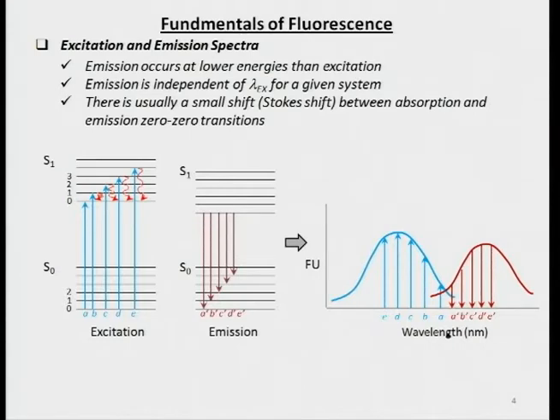Okay, so here's some background on where you should look for fluorescence. In essence, the excitation of the system gives us certain information. Most of the time the excitation is similar to the absorption spectra that we typically detect in a spectrophotometer, and it arises from the ground state to various vibrational levels of the higher excited state.